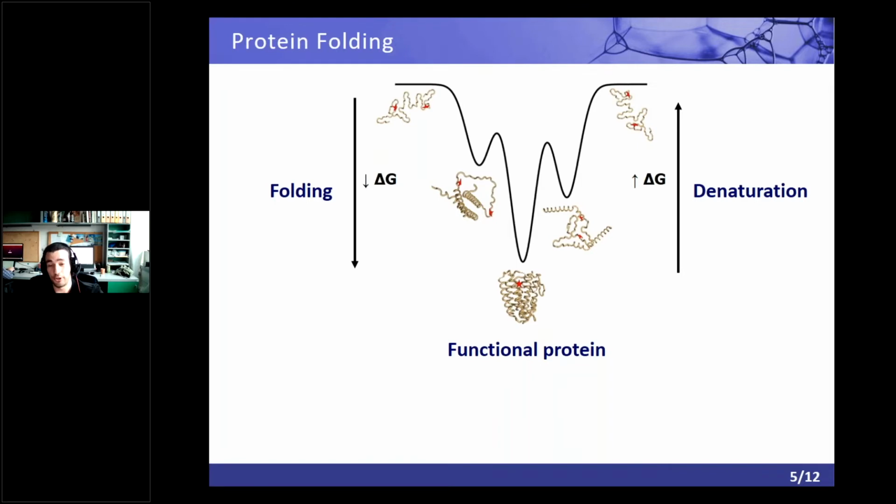the alternative approach is to go for experimental techniques where you denature your protein. And protein denaturation is typically that you increase temperature or you add some denaturing agent, and actually you follow the reverse process when you have a folded protein and then it starts to unfold. And then if you measure some signal, you can get some estimates about the differences in Gibbs free energies between different states, for instance. So you get some quantification of those states.